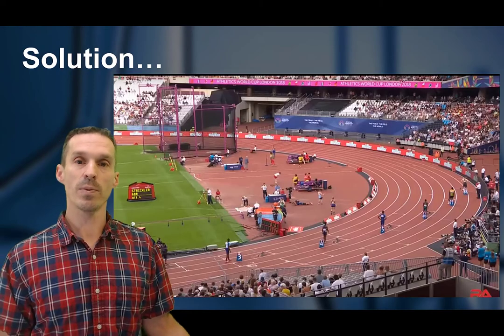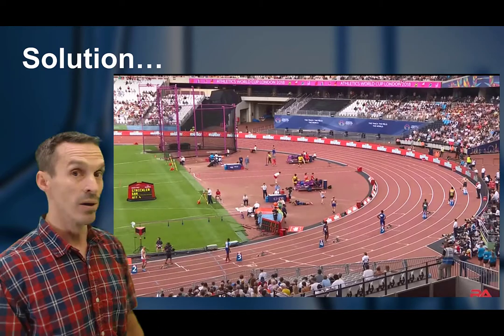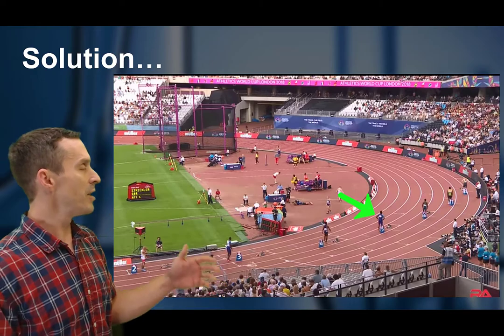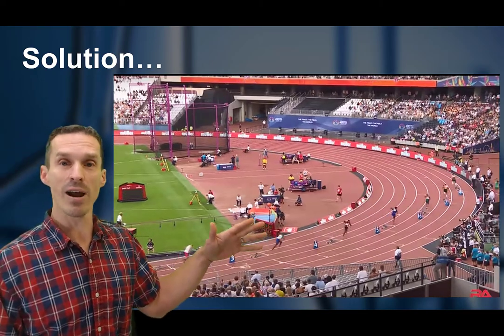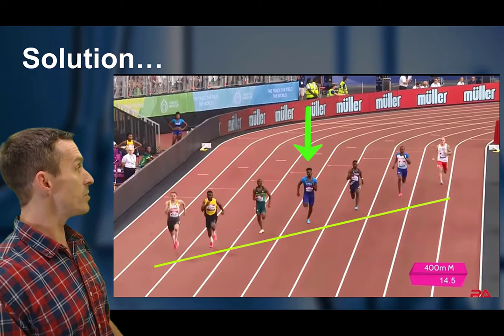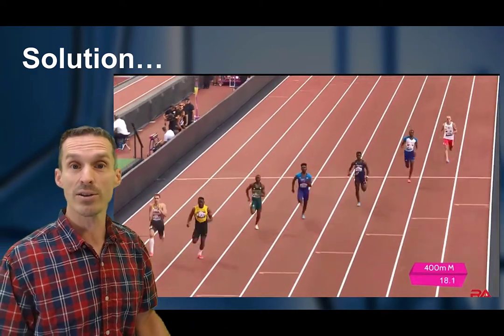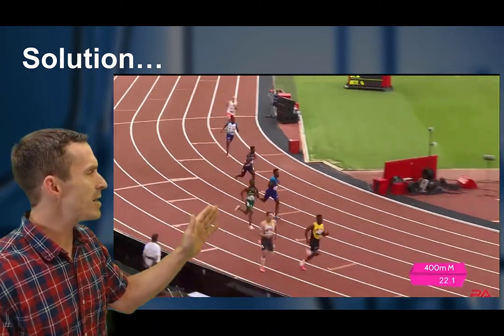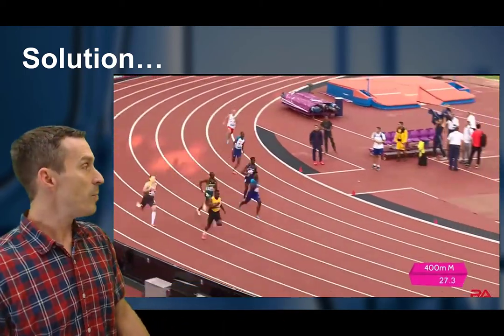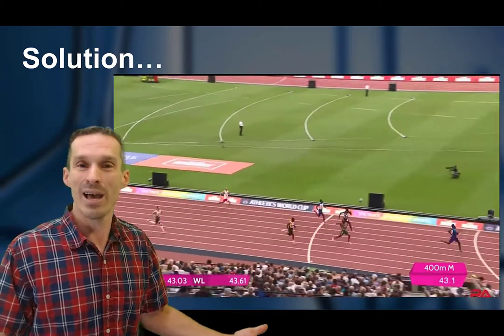So the solution that is proposed is to build a different kind of time of flight instrument. And the best analogy is right here. You know when you have those racetracks, the athletes that are running on the outside of the track look like they have a head start, but that's because they have to go around a bigger loop. So they have to travel more distance. Right now it looks like somebody's in front and they're traveling down the straight track, so everything's kind of even, but as they go around that curve, the people in the middle of the track actually have the advantage. They don't need to go as far anymore. So in fact, they were actually ahead all along.